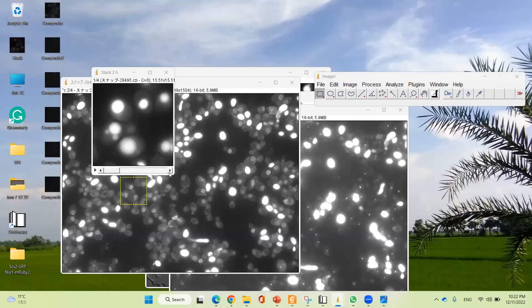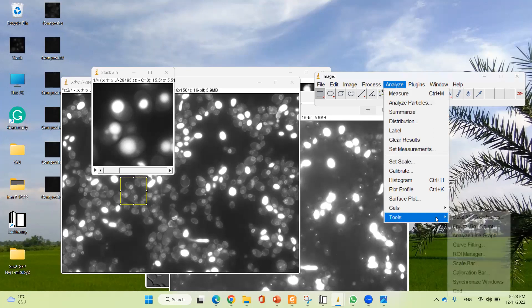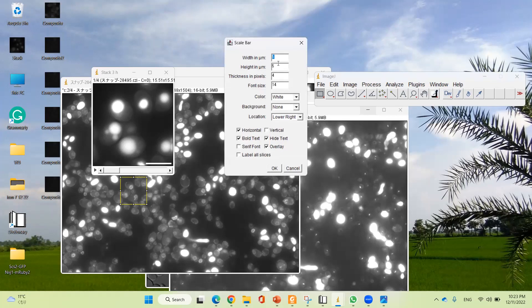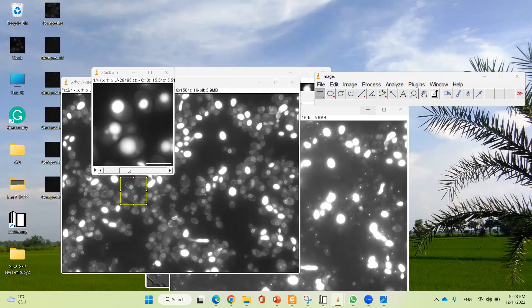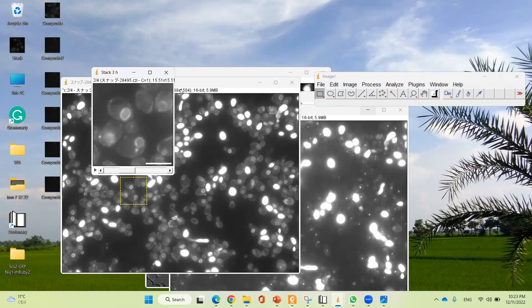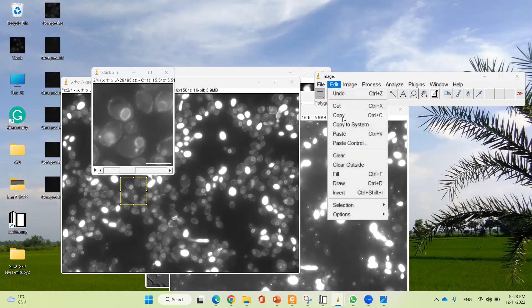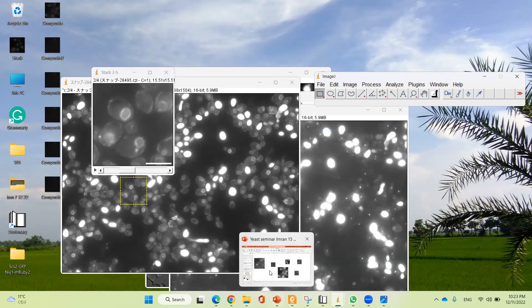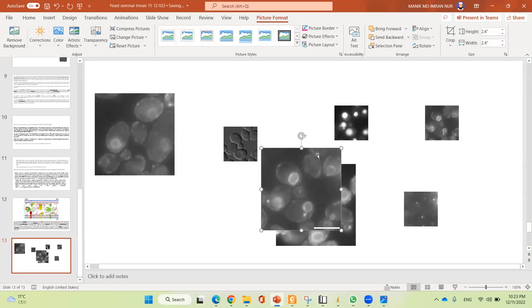Now I'm going to apply a scale bar to this image. To apply the scale bar, go to Analyze, then select Tools, then select Scale Bar. If you do not tick the 'Hide text' option, the label will appear below the bar. I'm going to hide the text. The width should be 5 micrometers and the height should be 5 micrometers. Thickness and pixel settings are OK. Click OK. The scale bar has been applied. I only need the scale bar for this image, so I'm going to copy it to the system.